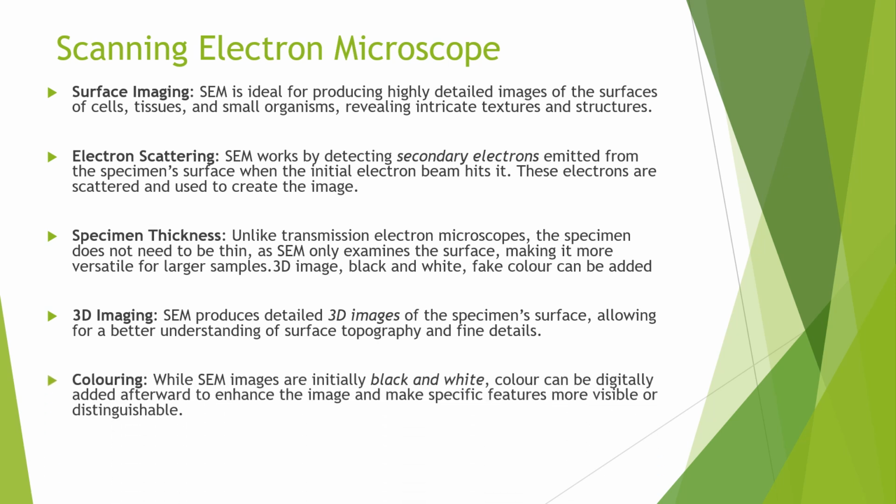Although SEM images are initially black and white, they can be digitally colored afterward to highlight certain features or make distinctions clearer. This flexibility in enhancing the image can be crucial for better visual analysis.